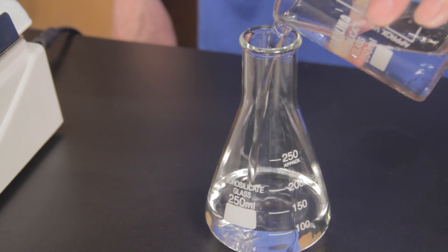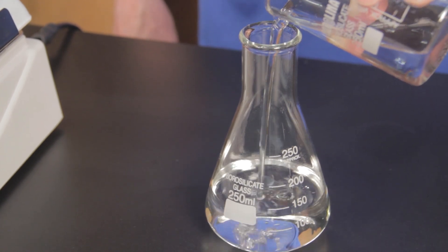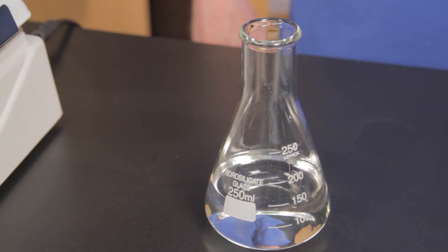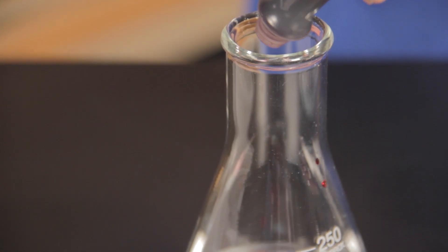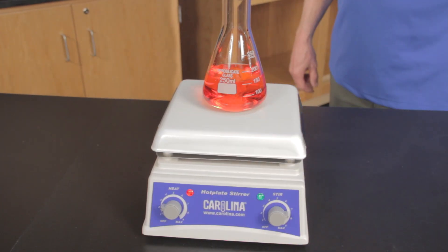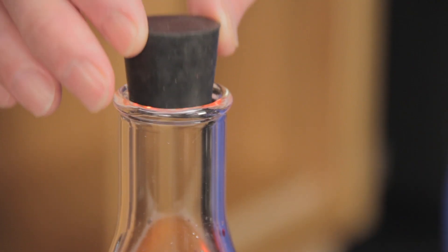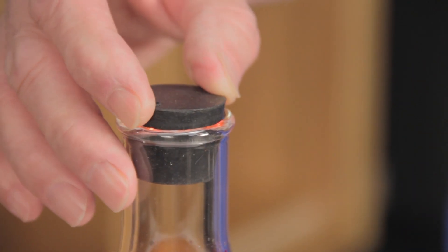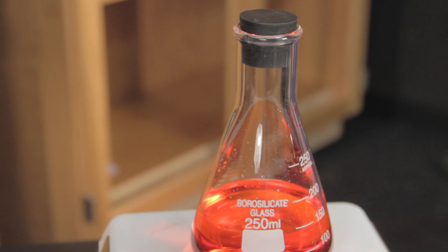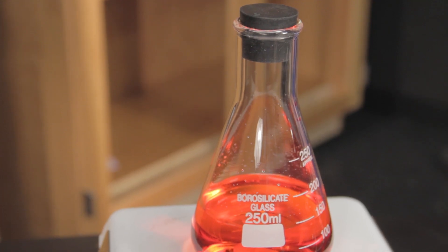The design of Erlenmeyer flasks creates a low center of gravity, making them the perfect vessels for mixing, stirring, holding, and heating solutions. Due to its large volume and small surface area, this type of flask minimizes evaporative loss and can be temporarily closed with the appropriately sized cork or rubber stopper.